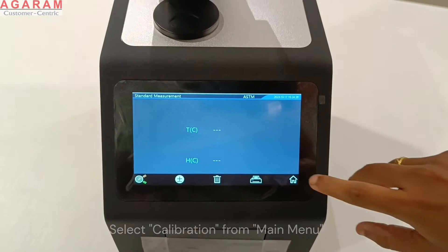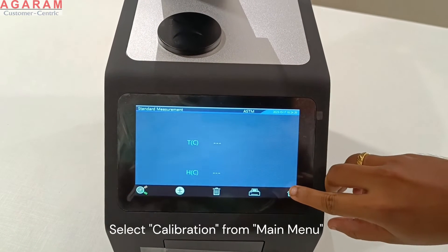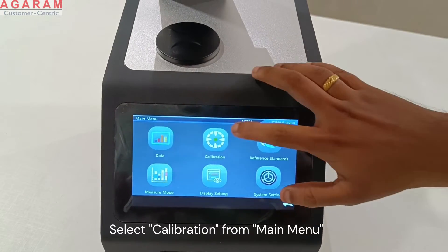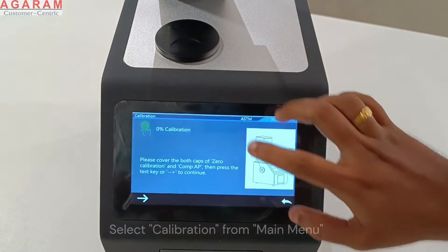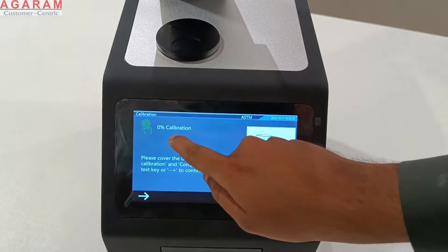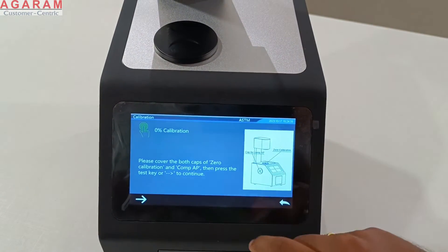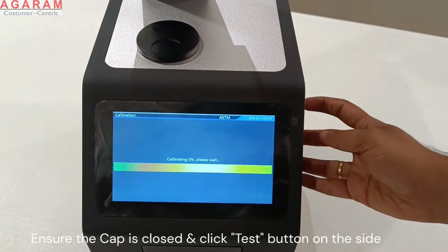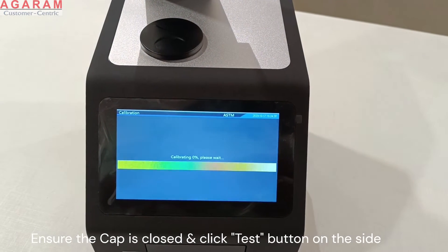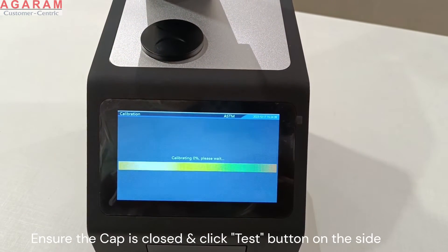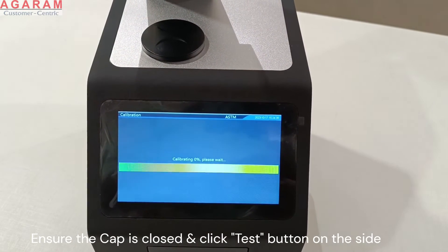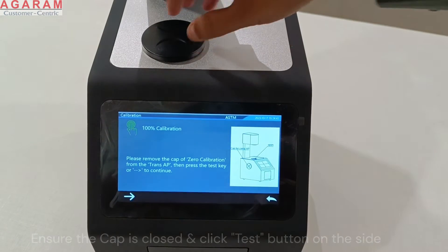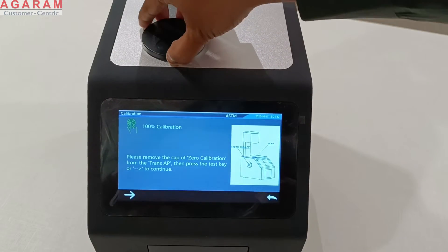To initiate self calibration, open the main menu and click calibration. During the zero calibration mode, the cap needs to be fully closed and no light would pass through the measuring aperture, simulating a 0% transmission of light.